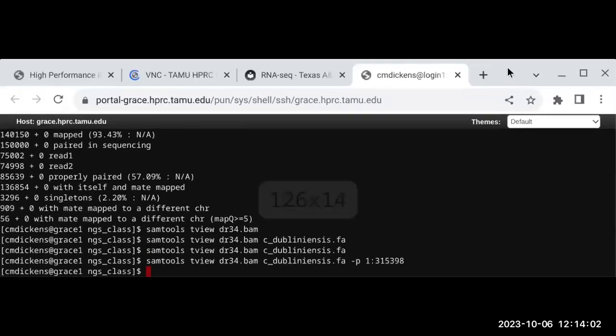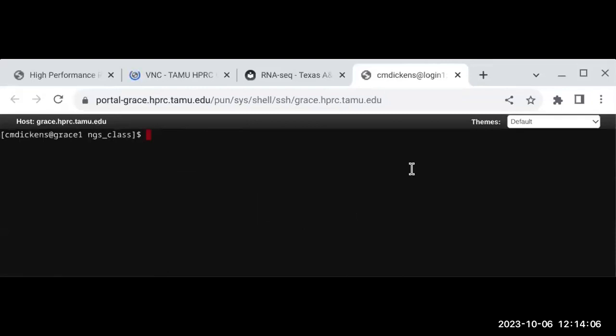I'm going to run this srun command. Control L to clear. You need to give it a time. I'm just going to do 1 hour, 0 minutes, 0 seconds. Mem equals. We don't need a whole lot, so we don't have to use the whole compute node. We only need one task.